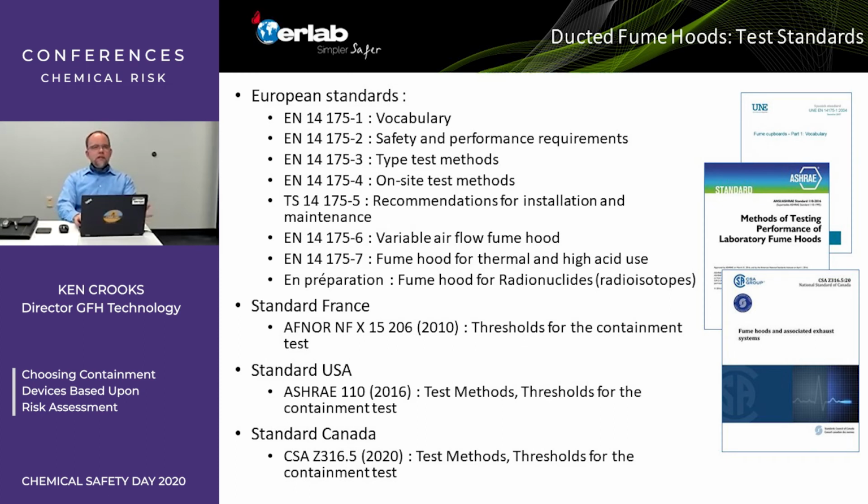Ducted fume hoods, test standards vary across the globe. I touched on this briefly previously, but EN 14175 has many different chapters and versions, all depend on the standard itself. I'm not experienced with 14175, but I think you can see that it covers all of that, how to test properly. It is a test standard for ducted fume hoods. In addition, in France, there's NFX 15206 for the thresholds for containment.